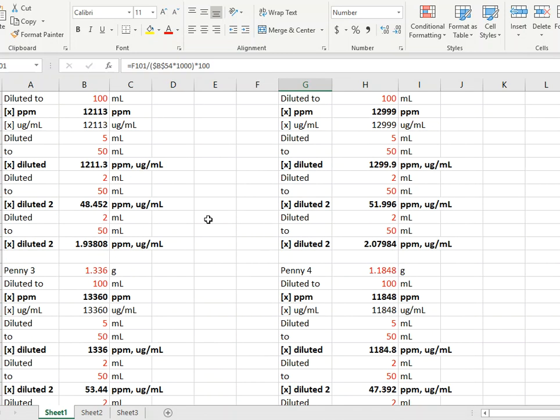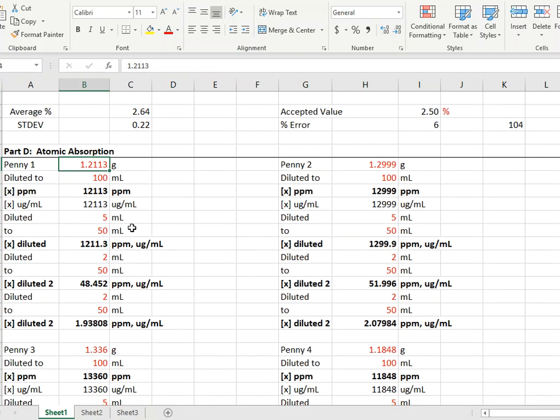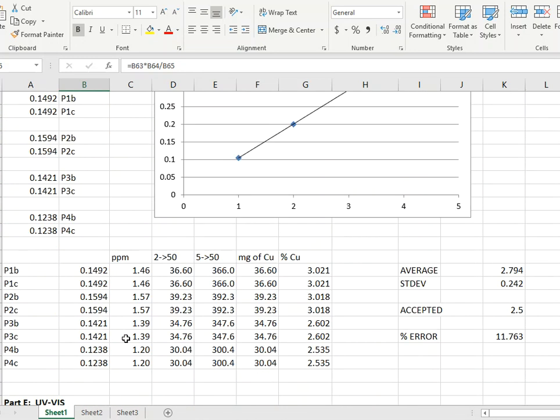Now, the reason that I did this up here at the very top, and the reason I introduced it, is because I wanted to show you the thought process of why we picked the standards that we did. So we're going to assume that maybe everything here is going to be copper. And notice that I've weakened it down to get a target range. It looks like these would run on par of about 1.9 parts per million, somewhere in there.